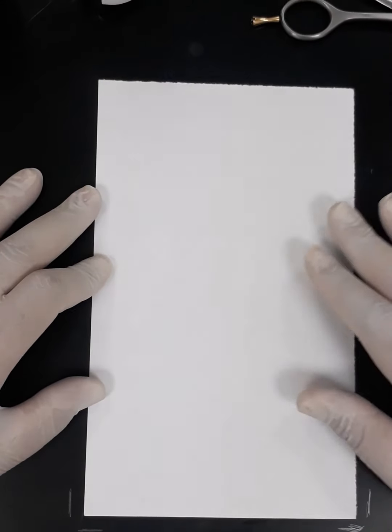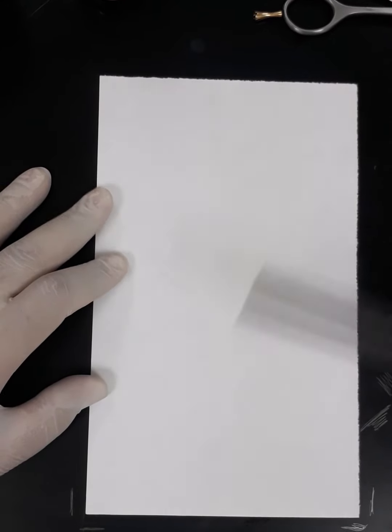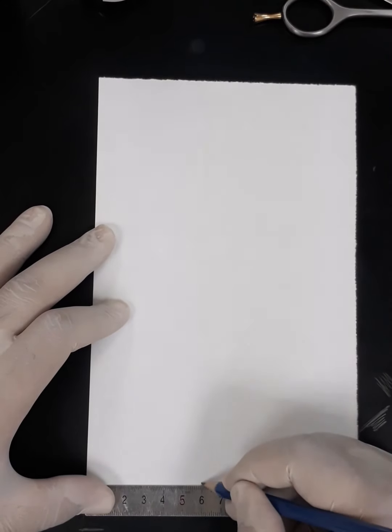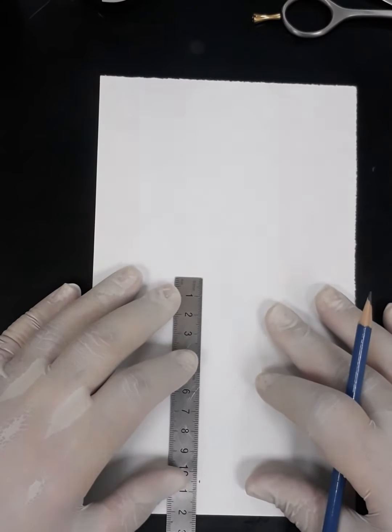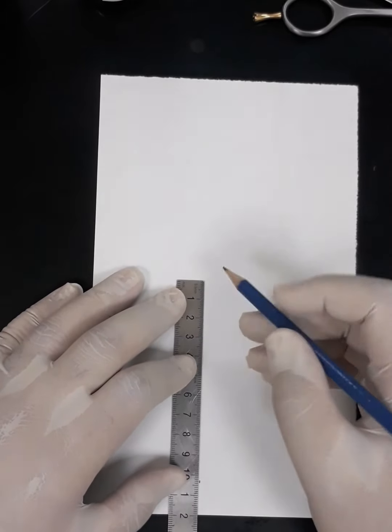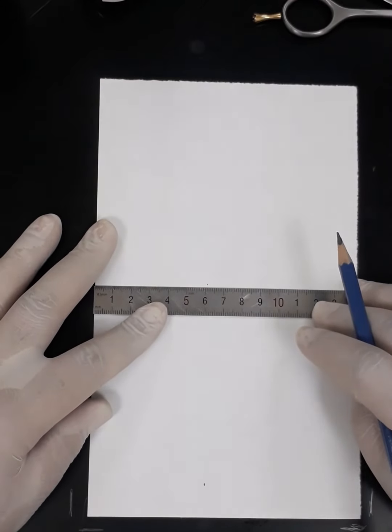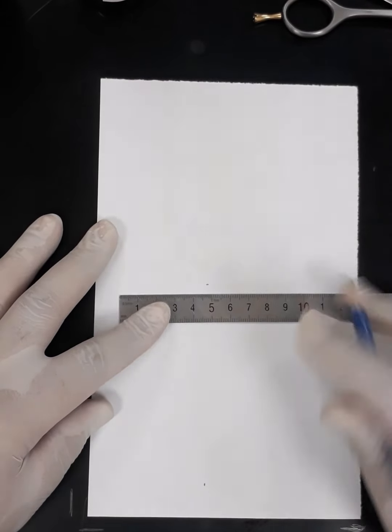So this is our chromatographic paper, and we know that the width required is only 6 centimeters. So by the ruler, I will mark 6 centimeters for the width. And for the height, it is 12 centimeters. So here, or sorry, we said 11 plus 1, so 12, yes. Okay, I think I have a bad memory. And here once again, 6. So I think everything is fine, we just have to tilt it a little bit to the right side.